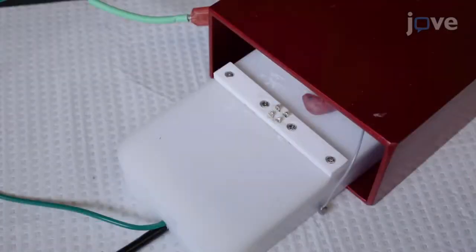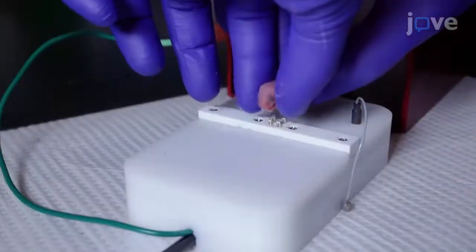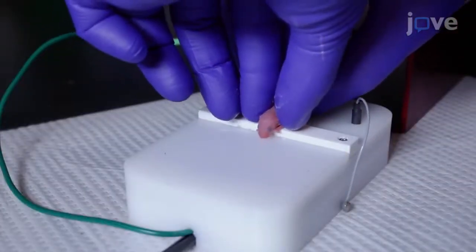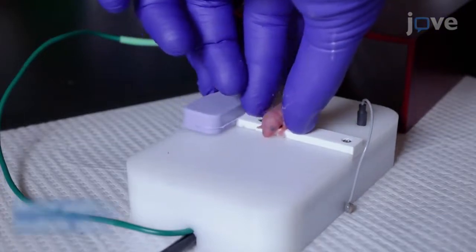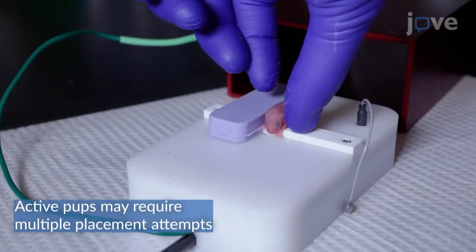When each electrode is completely covered with gel, place the neonatal mouse pup onto the platform in the prone position with the head of the pup facing the outgoing USB edge of the platform, with each electrode covering a portion of the pup's upper thorax.